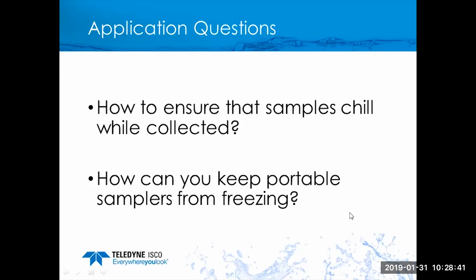But at the bottom line, if we do have temperatures that are minus 15 degrees Fahrenheit, or even colder, Mother Nature will win without any active heating. There's only so much one can do. You can help slow it down. You can help abate the issue by adding insulation and some protection of that nature. But in the absence of any active heating source, when it gets so cold, again, there's only so much one can do.